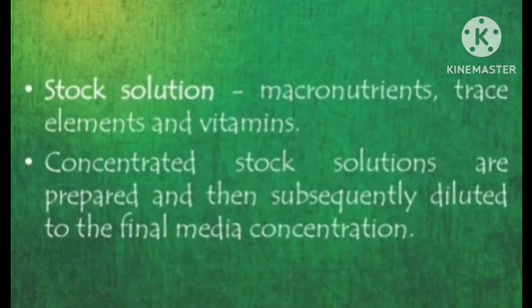It will be cultured. Next, stock solutions: macronutrients, trace elements, and vitamins are prepared as concentrated stock solutions and then subsequently diluted. These stock solutions are diluted to get the final media concentrations.